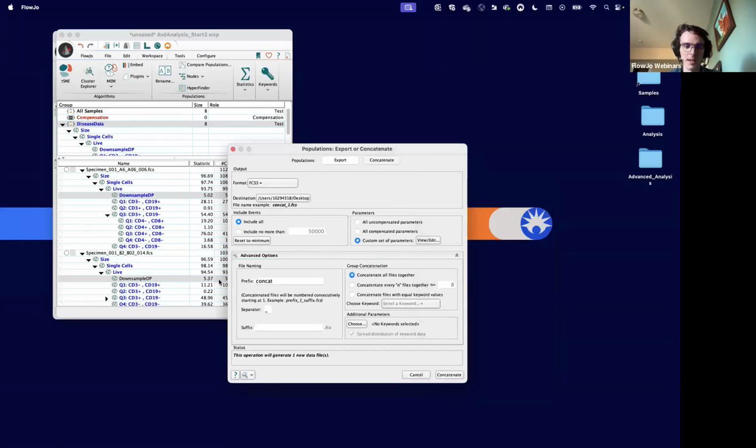I'll press OK. I can give it a name. I might call it something like combined live, for combining the live cells.